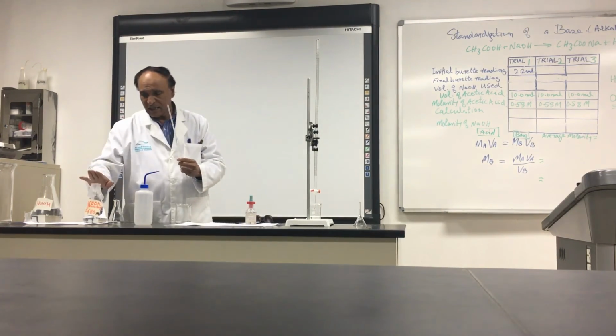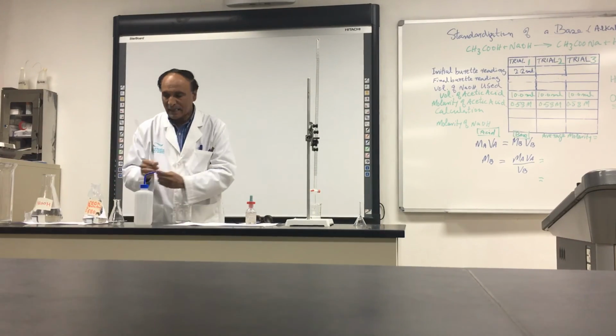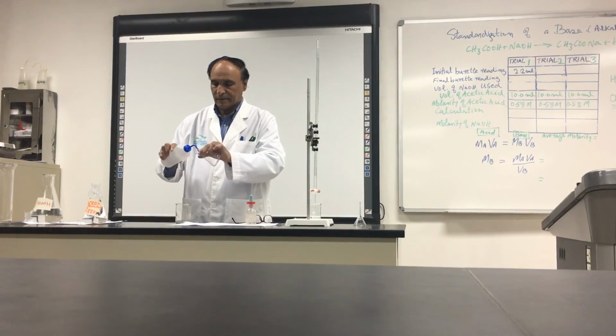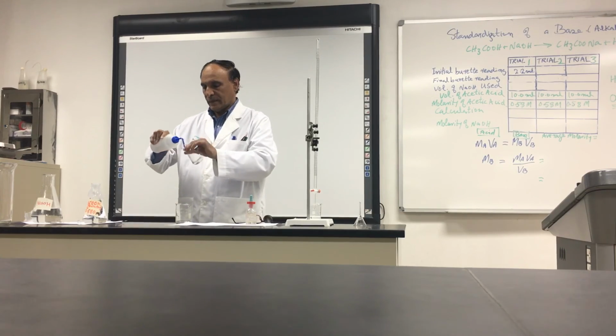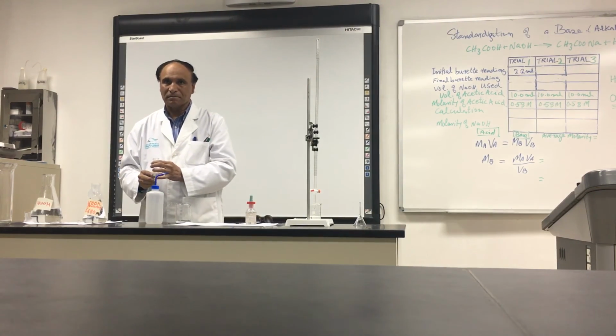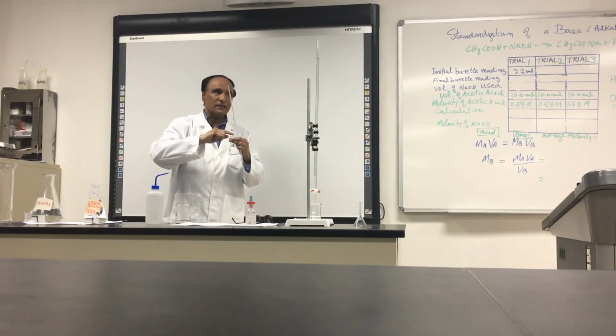Now wash it with the vinegar, with acetic acid. Also he will wash the flask. The second student is doing this. He will take these two things, both washed.